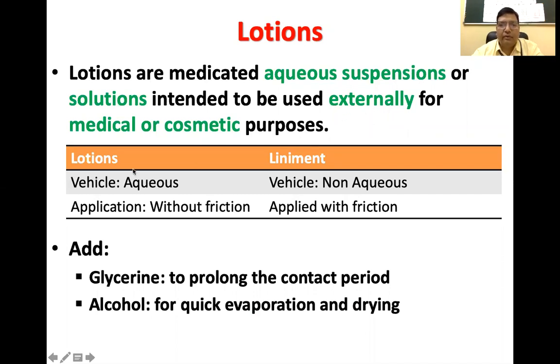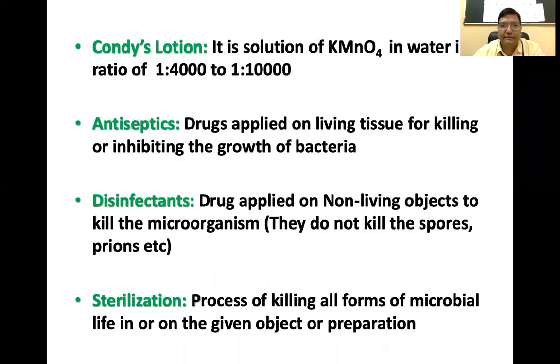So if we talk of lotion and liniments, the main vehicle in lotion is aqueous, while in liniment it is non-aqueous. Liniments do have a greasy base. Lotions are to be applied without friction, while liniments are generally applied with friction or rubbing. Glycerin is added to preparations to prolong the contact period, while alcohol quickly evaporates and dries the surfaces.